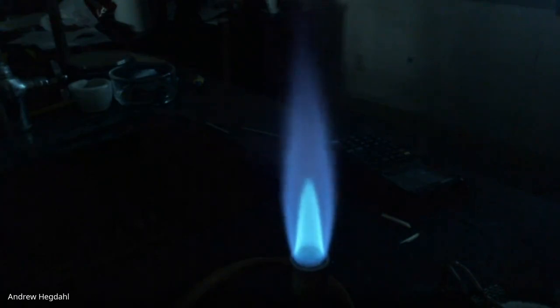Don't put your pencils or any other things like that into the fire. Okay? So when you guys are finished with the lab, you're going to have a bunch of charred wood splints in here. What you're going to do is take the wood splints, throw them in the garbage, dump out your water, and then fill it back up. It comes out fast, so don't just crank on it. And then leave it set up for the next group.